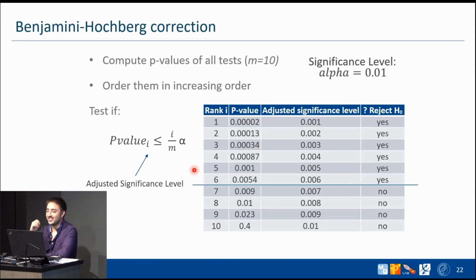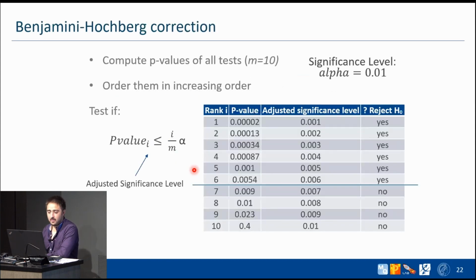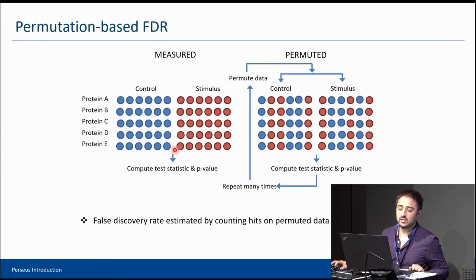Yeah, thank you so much for that question. The answer is yes, and it's on the next slide. It's the permutation-based FDR test, and it's the one we use by default. As the colleague said, the problem here is that the t-test assumes normality. You can still use it sometimes, but you have to be sure that your distribution actually has a Gaussian shape. We also have another alternative, the permutation-based FDR test, and this does not assume normality. So you can just use it without thinking a lot, because it's very robust. So how does it work?